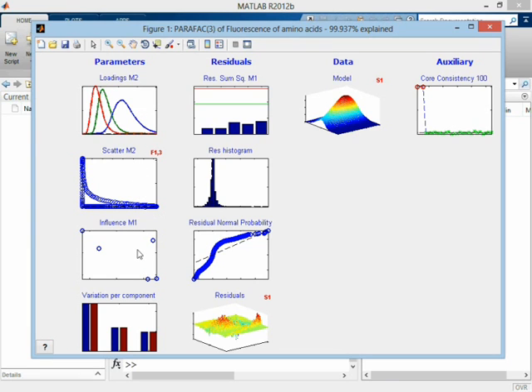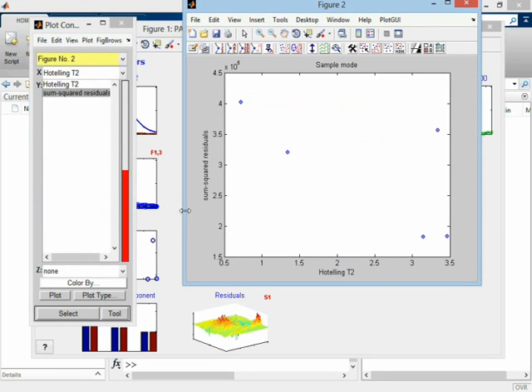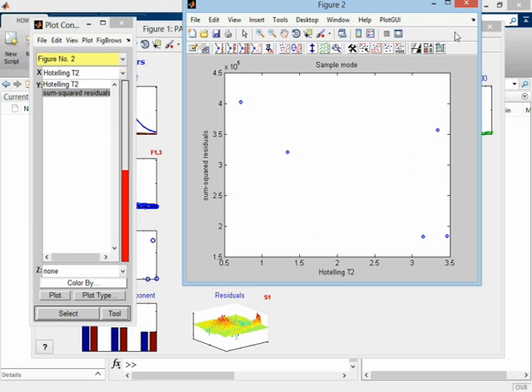Down here, we have an influence plot. If we right-click, we can see that it's just the sum squared residuals versus the Hotelling's T squared. So this is what we can use for detecting outliers, for example.